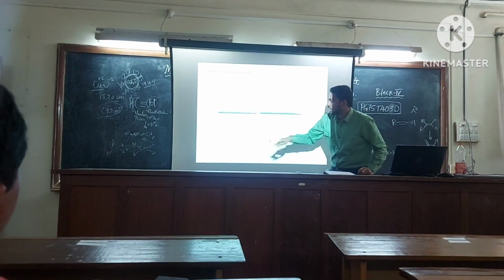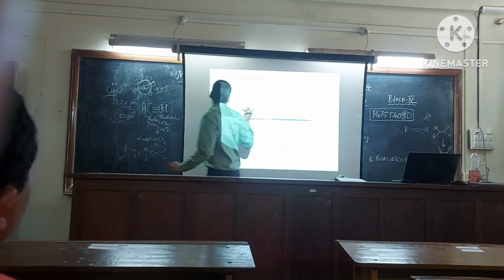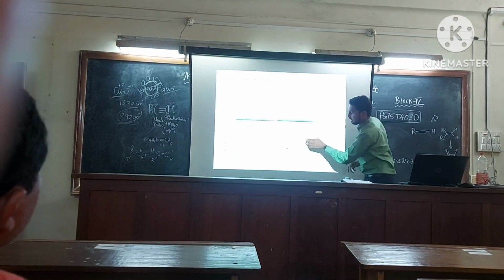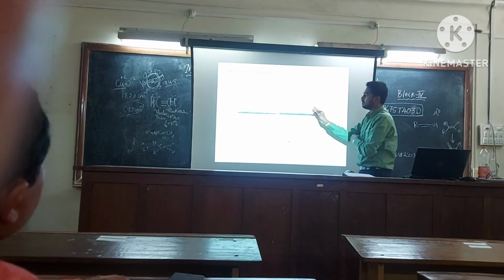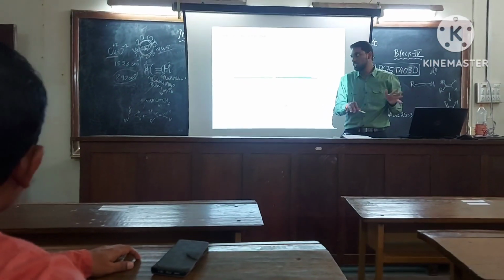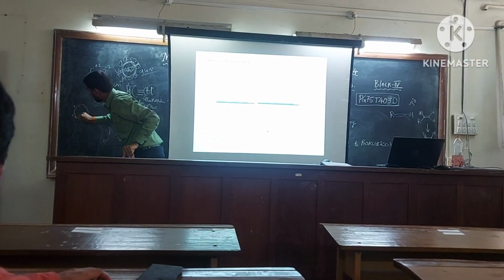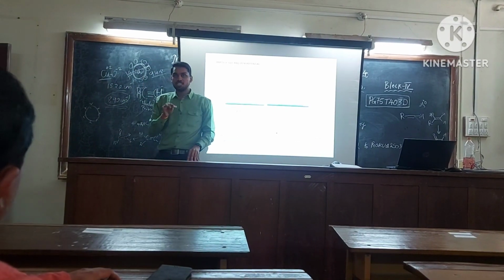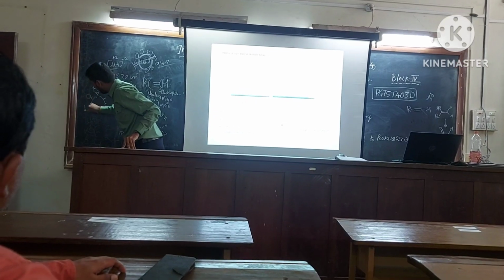So the other one is zeta potential. Here in this graph you can see that the peak has appeared at exactly 67.7 millivolt. It means it has come on the positive side. So positive side means the copper oxide nanoparticles are carrying the positive charge. As I mentioned earlier, we have used water as the dispersed medium, so OH will be there. OH will be acting as a negative, and they will be surrounding this positive charge.